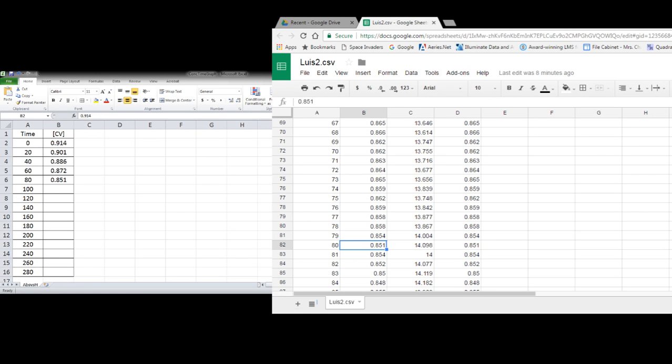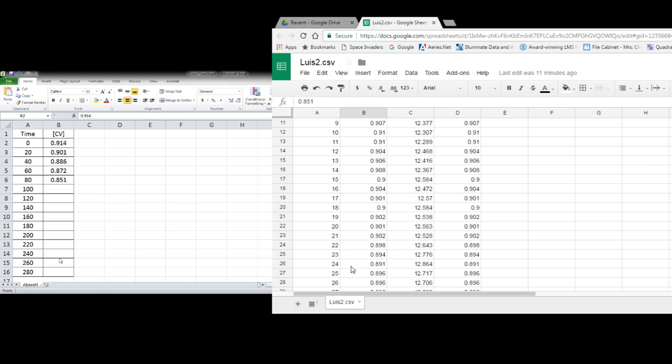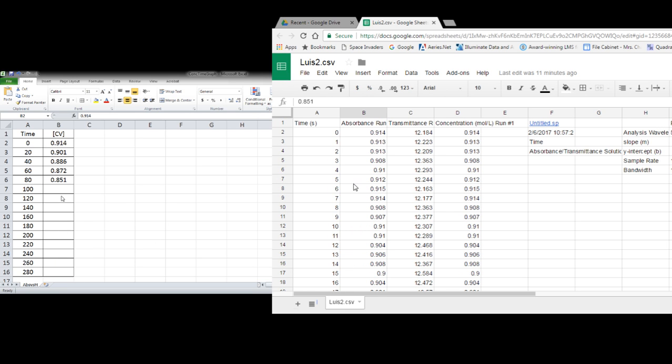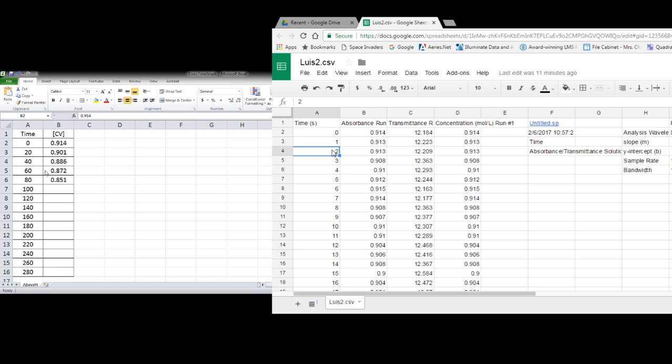Okay, in this video we are going to learn how to get the absorbance data plugged into a graph. You notice here we have some sample data. It's every second the spectrometers take it every second and I think that's overkill for this lab.